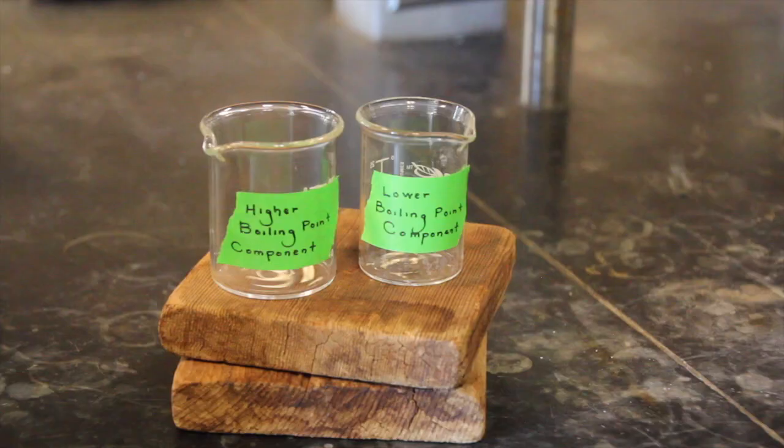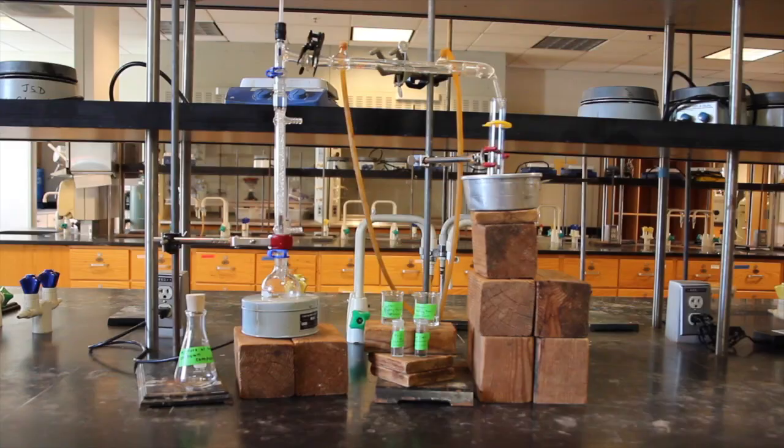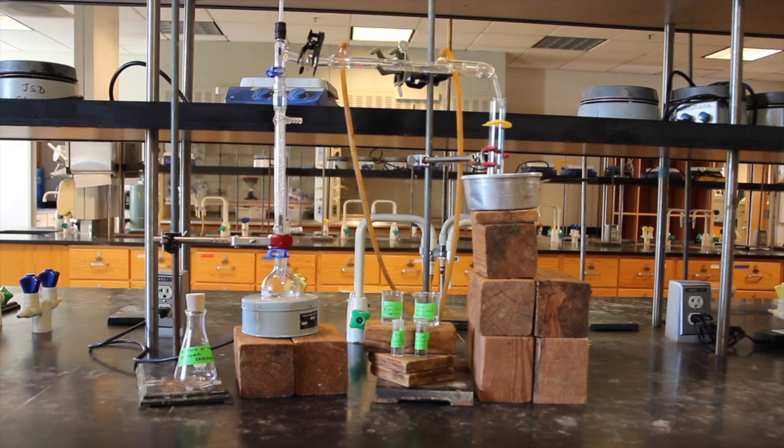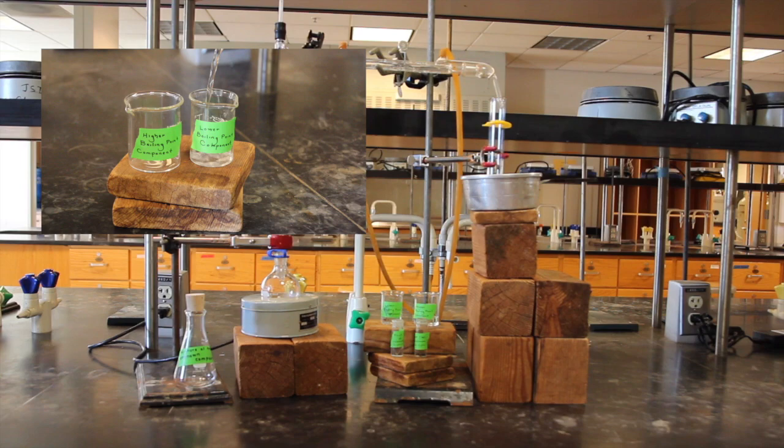Save the first milliliter from your distillation as a separate sample in a labeled conical vial. Next, you will be collecting the rest of the first distillate, emptying the graduated cylinder as needed into a labeled beaker or flask. Continue to do so until the distillation temperature has risen to approximately five to ten degrees Celsius above the apparent boiling point of the lower boiling component.